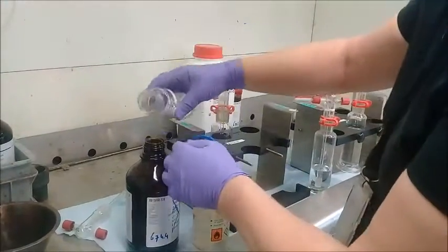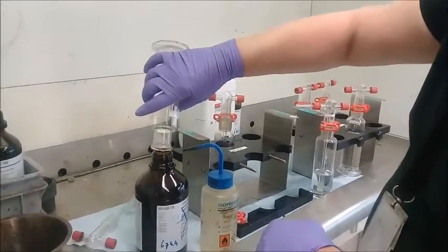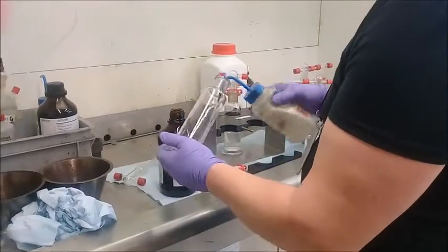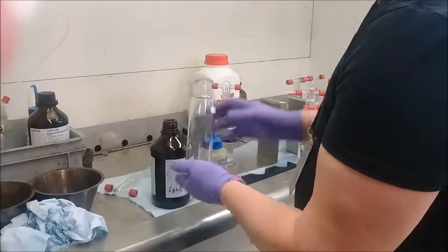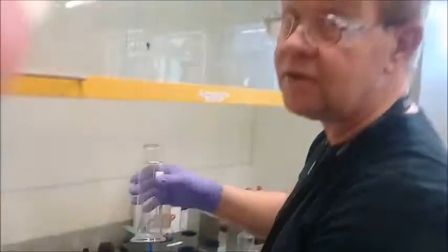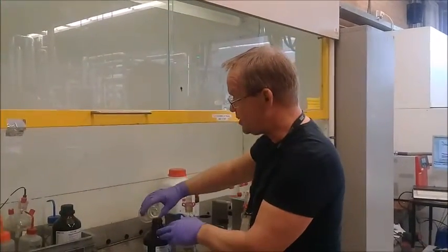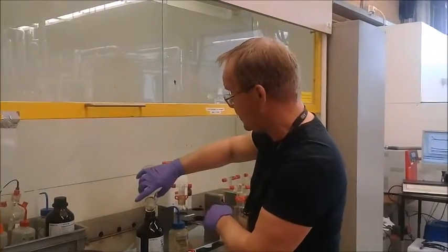It's nicely rinsed. I'm going to do that like 2 times in order to rinse out any remaining hydrocarbons from the wall. And we have to be careful not to put more than 1 liter in the bottle, of course. So we have a limitation for the amount of liquid going into the bottle, which should not exceed 1 liter.